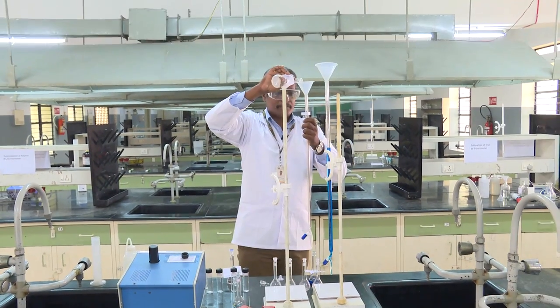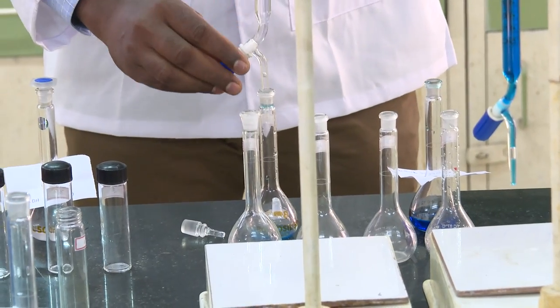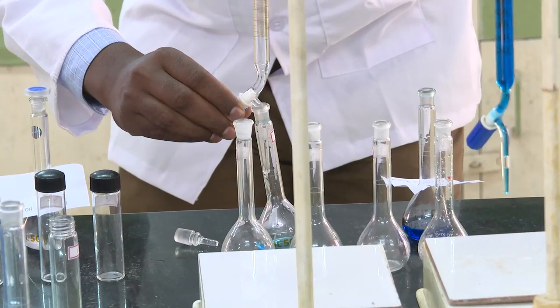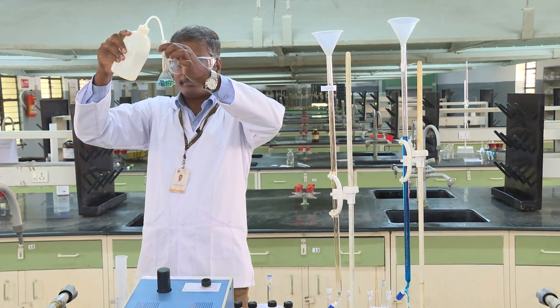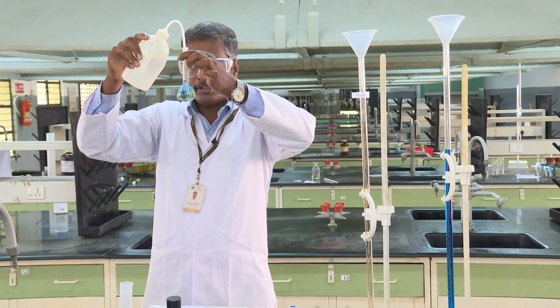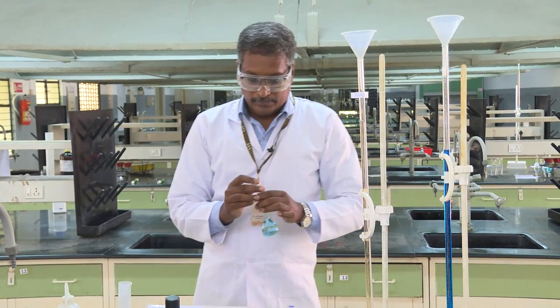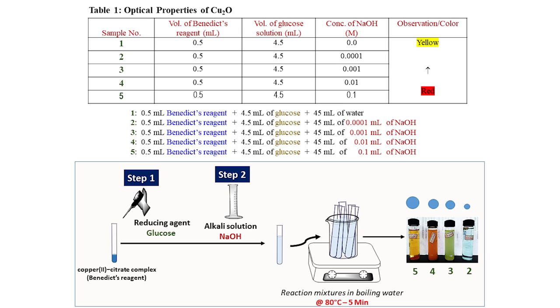We use another burette to add sugar solution — 4.5 ml — to sample 1. It should be read at the lower meniscus. Do it carefully when closing, and then shake this first sample so that the solution is homogeneous. Likewise, we make samples 2, 3, 4, and 5 keeping the volume of Benedict at 0.5 ml and glucose at 4.5 ml, while varying the sodium hydroxide.